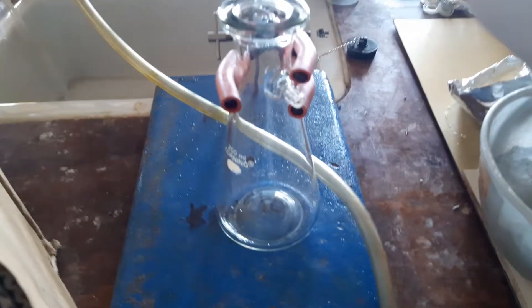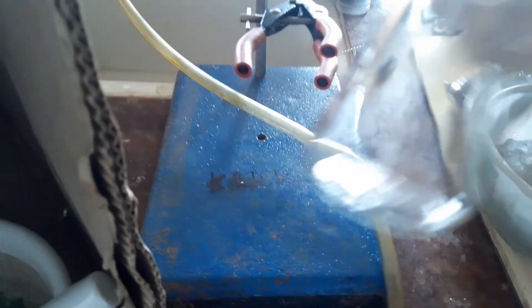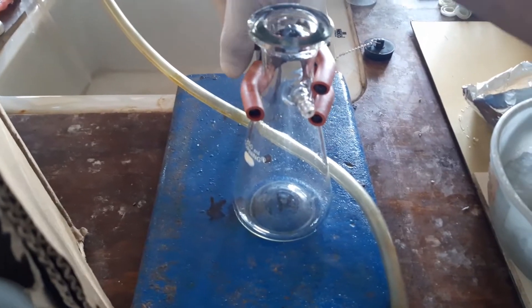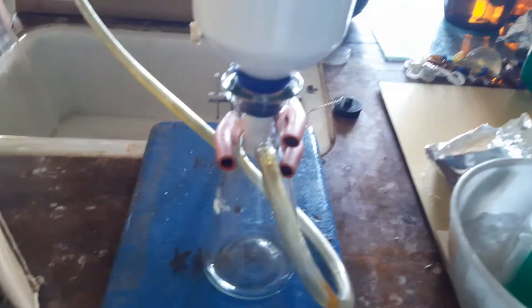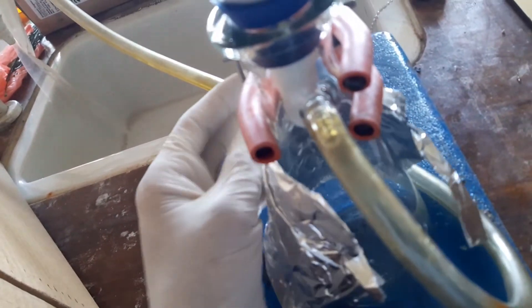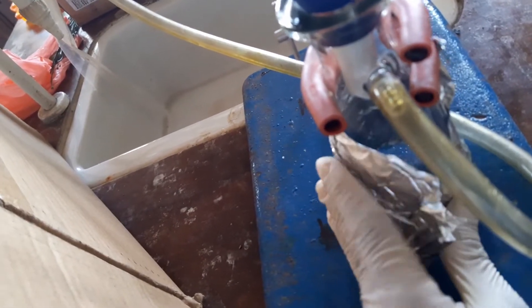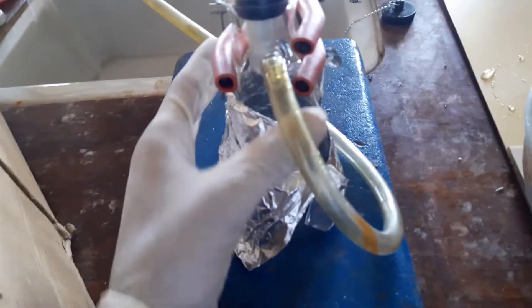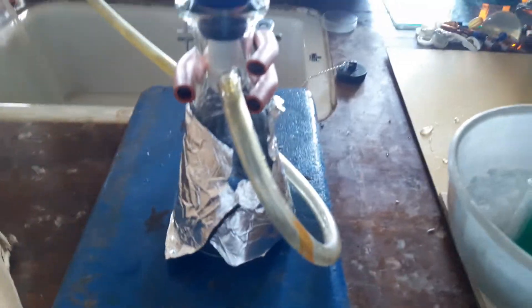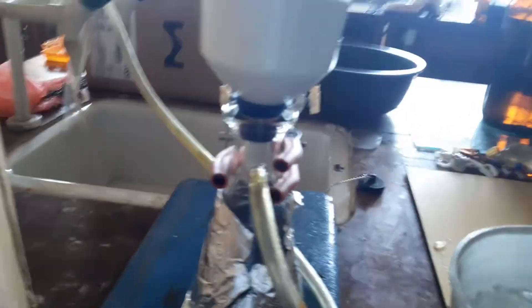First of all, we have to wash the filter paper and the glassware properly. Now we connect our vacuum for ease of filtration. Next, we will cover our glass separators as much as we can. Working with a single hand is very hard, but I will manage. You have to cover it properly.